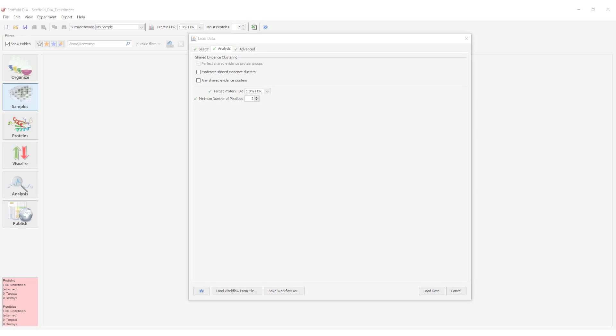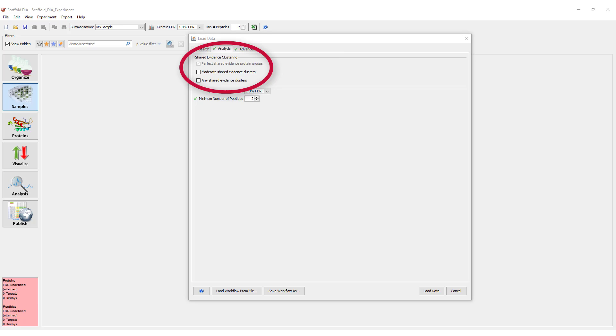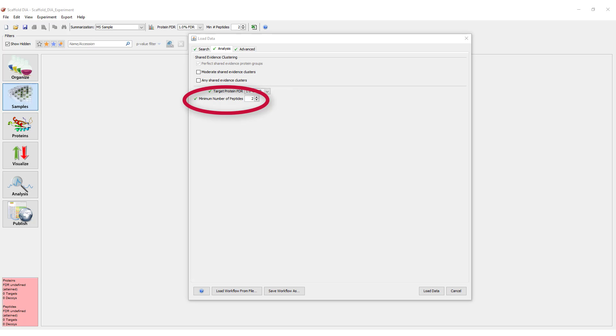The first parameter on the Analysis tab sets the Shared Evidence threshold required to cluster proteins. Next, you can change the target protein FDR and the minimum number of peptides required for identification. Unlike the peptide level FDR threshold, these can be changed in the samples view after data is loaded.